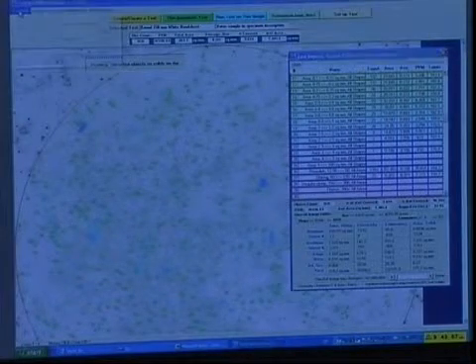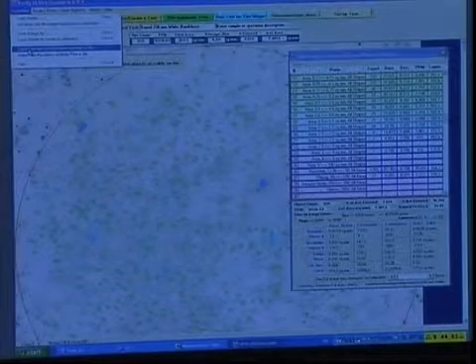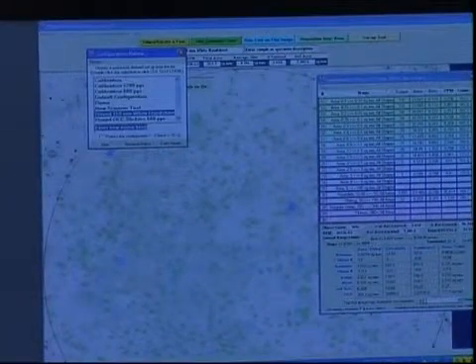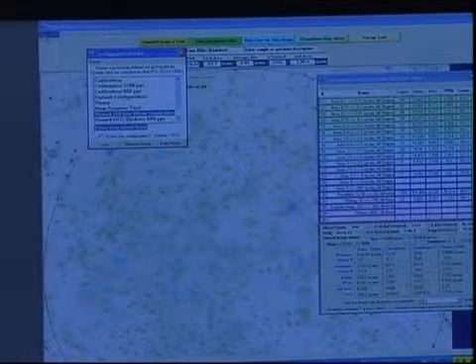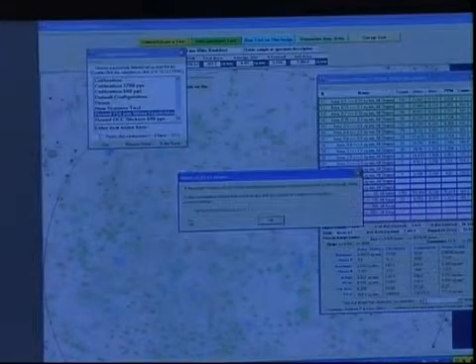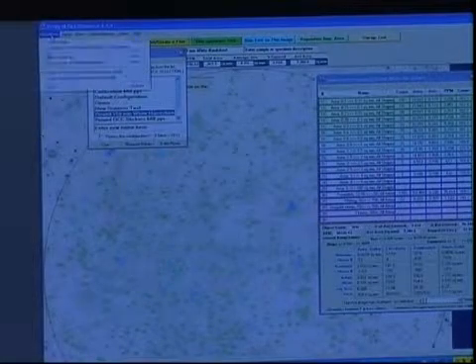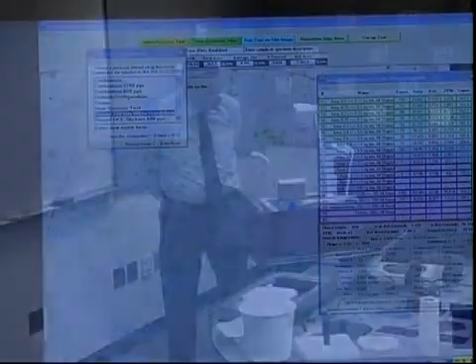Things that you should know: you can export the settings. What you see here is the round handsheet. All of the settings can be exported anytime you wish by just going to Functions, and you can export it, and you can email it to another user who has the same system, and they can very simply load it into their system by using the import controls. I exported it, and now I can import it. That is basically the system at work.